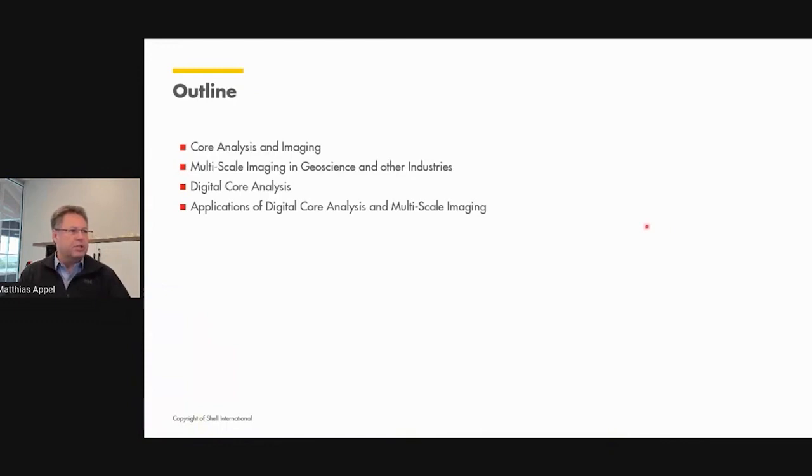I was told that the presentation should take between half an hour and 40 minutes. So roughly in that time scale, what I had in mind was to tell you about what we do with core analysis and how imaging plays a role in the core analysis workflows, how multiscale imaging comes into the discussion, and not only for the geoscience kind of applications, but also for other industries. And then leading into the element of digital core analysis and the application of multiscale imaging and digital core analysis for our workflows.